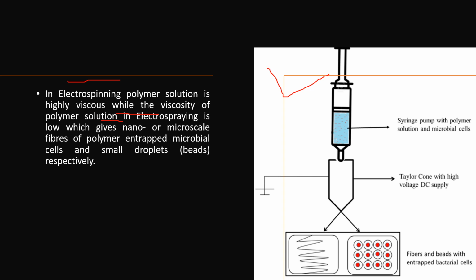This will push the polymer solution and microbial cells. This will form a weave in which the microbial cells are entrapped. These are the fibers and beads with entrapped bacterial cells. These are the fibers and these are the beads. These both contain microbial cells.